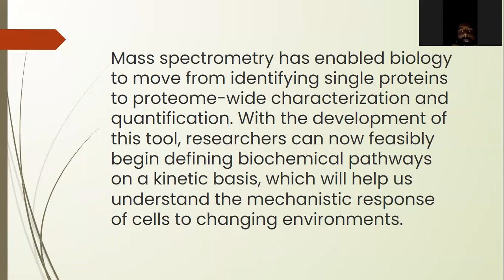Mass spectrometry has enabled biology to move from identifying single proteins to proteome-wide characterization and quantification. With the development of this tool, researchers can now feasibly begin defining biochemical pathways on a kinetic basis, which will help us understand the mechanistic response of cells to changing environments.